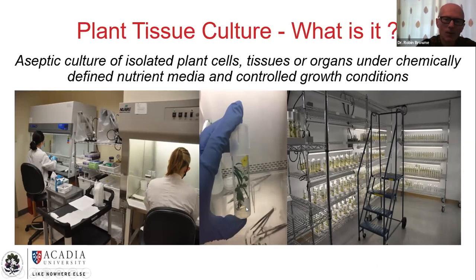But apart from what's needed to prepare the nutrient medium here, typically a tissue culture facility will need clean air chambers of some sort in order to do aseptic manipulations, as well as a growth room, shown here, where cultures can be maintained and manipulated after the transfer process.